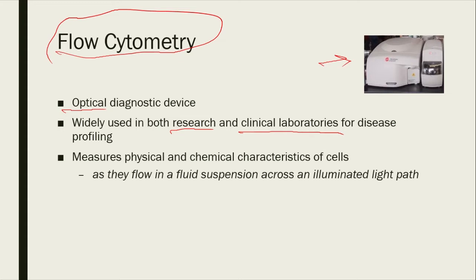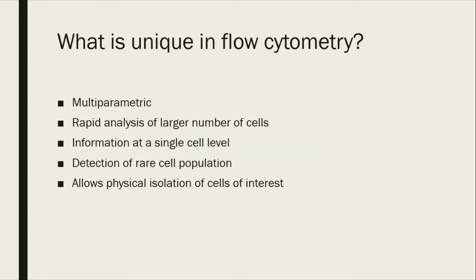So what it looks at is some of the physical and chemical characteristics of cells as they flow in a fluid suspension across an illuminated light path. There is a light going through these cells, and we're going to talk about that in greater detail. Don't worry.